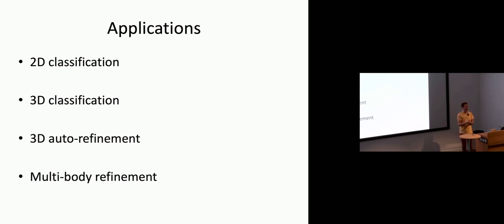What to do if the first assumption I made about Jan's data set, that there was only one three-dimensional structure, is actually not true in practice. And of course, many of our molecular machines have different conformations as part of their functioning cycle, so we're actually interested in all of those. So that's where a lot of the power of cryo-EM image processing comes from. But I won't go into those details today.